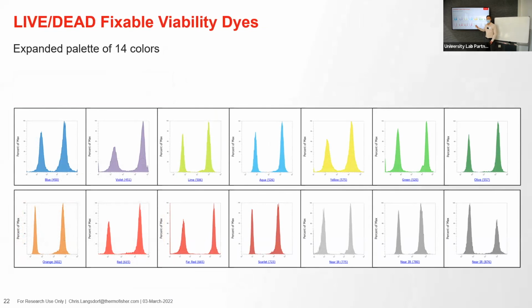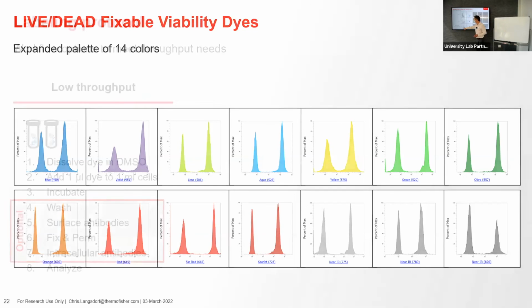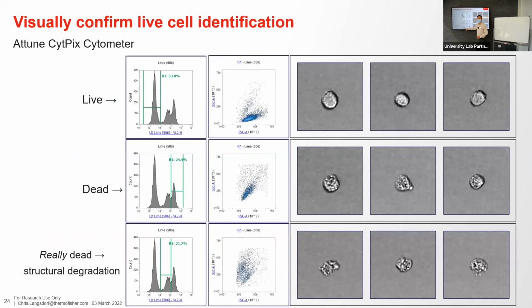Do you think this happens in the lab? No. I really killed these cells to make them that positive. And these were nice 100% live cells mixed together, and it makes a nice figure. But in reality, especially if you're using blood, where you have lymphocytes, monocytes, neutrophils, different sizes of cells, cells from different tissues mixed together, you might have something more like this, where you have 3 peaks. And I get this question all the time. I don't have 2 peaks, I have 3 or 4. Where should I gate?